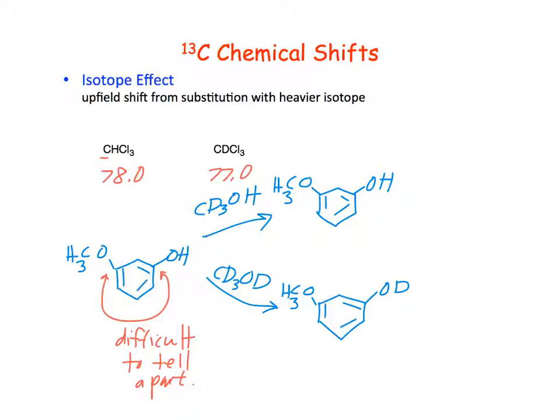And if we compare these two, these would have the same chemical shift, and these two would have different chemical shifts.